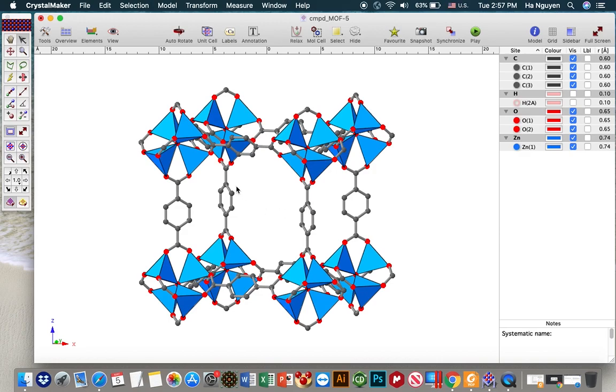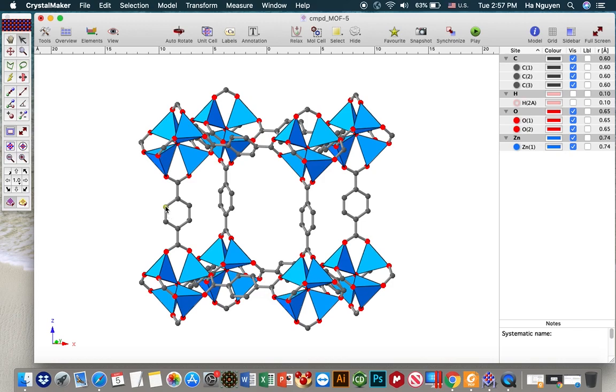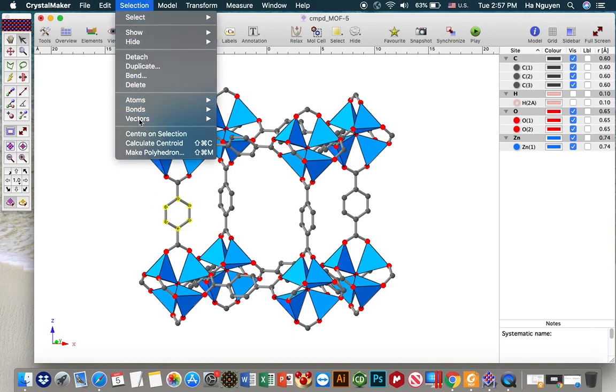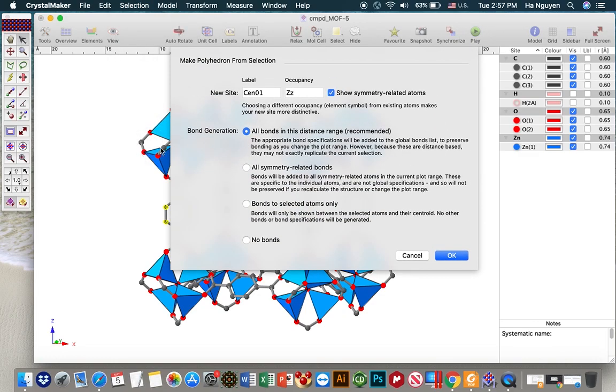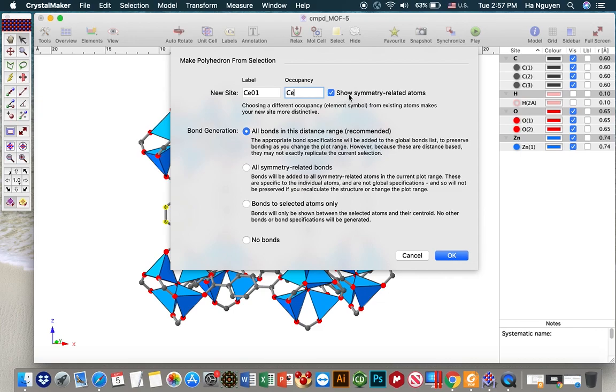And for the second purpose, the one that you want to show - you want to distinguish the linker in case you have a very complex structure or you have a mixture of linkers. So to do that, I normally choose phenyl ring and then selection, make polyhedron, and I put it center. And if you choose to show symmetry related items, you will have all of the things related to the symmetry of that position will be shown. Otherwise you only see one position.